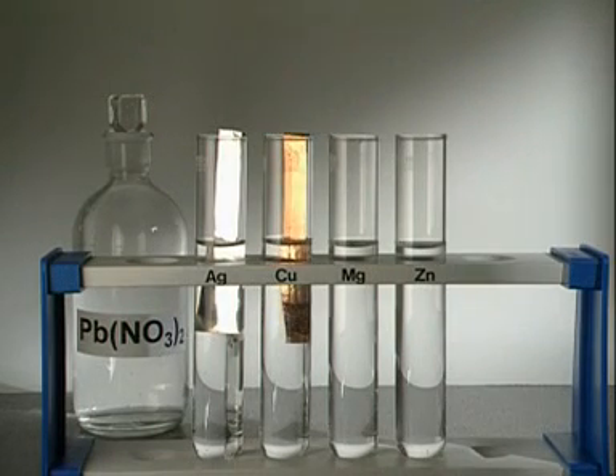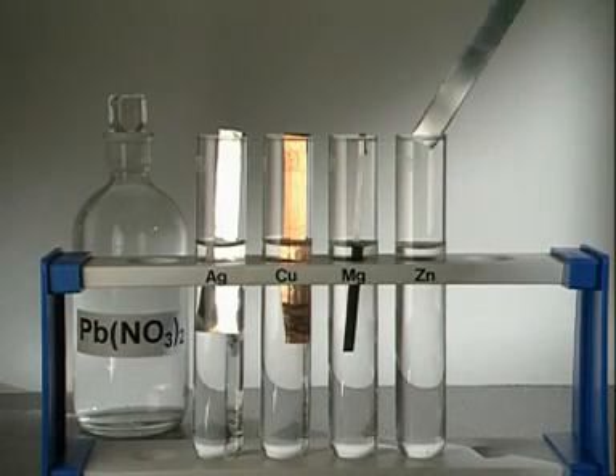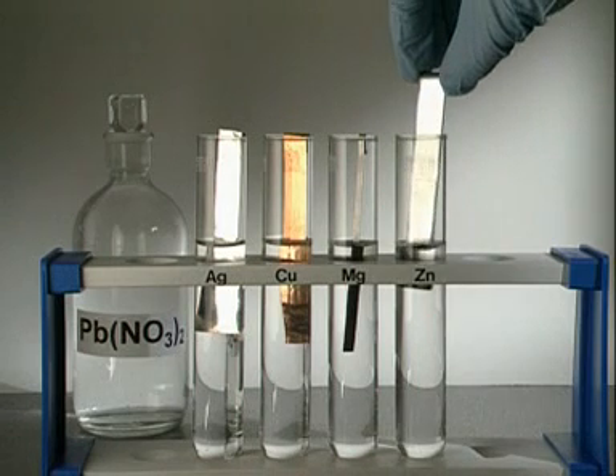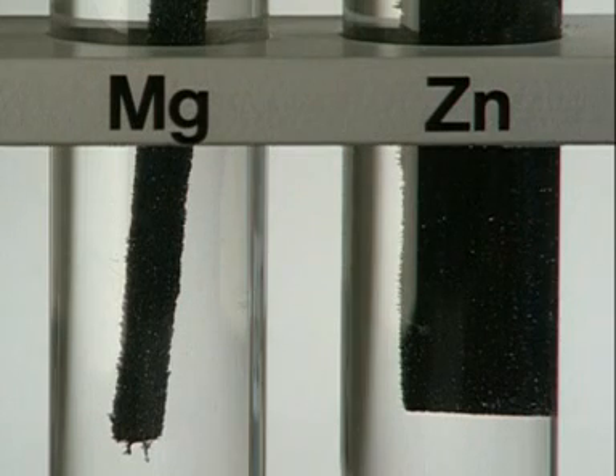Placing the metals in lead nitrate solution provides our first clue. Silver doesn't react, and neither does copper, but magnesium and zinc both become coated with a dark grey layer of lead.